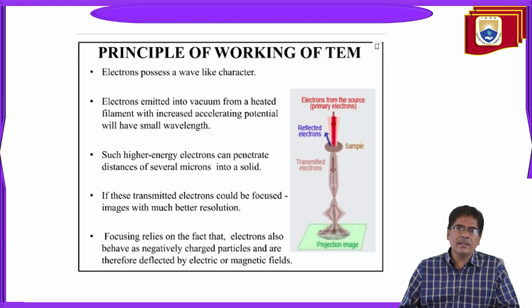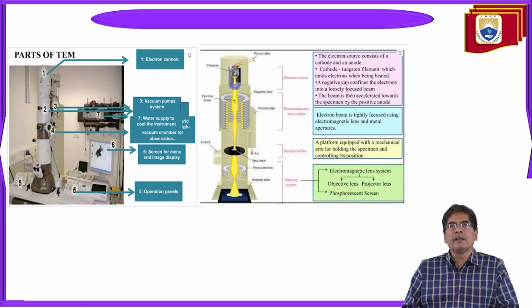Focusing relies on the fact that electrons also behave as negatively charged particles and are therefore deflected by electric or magnetic fields.